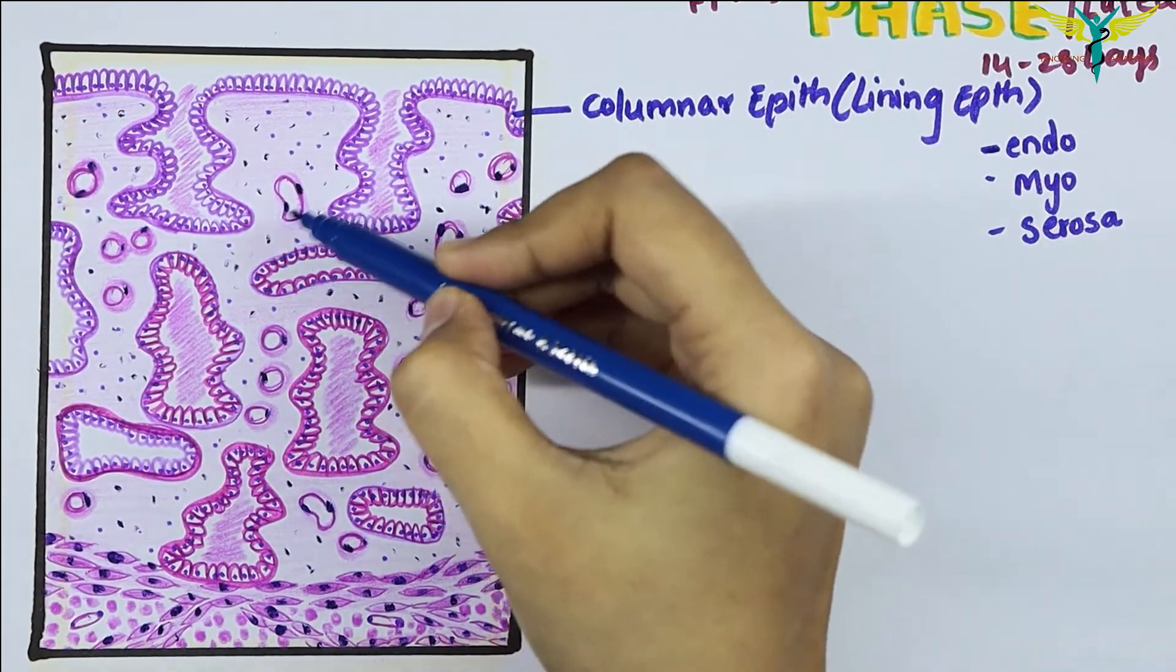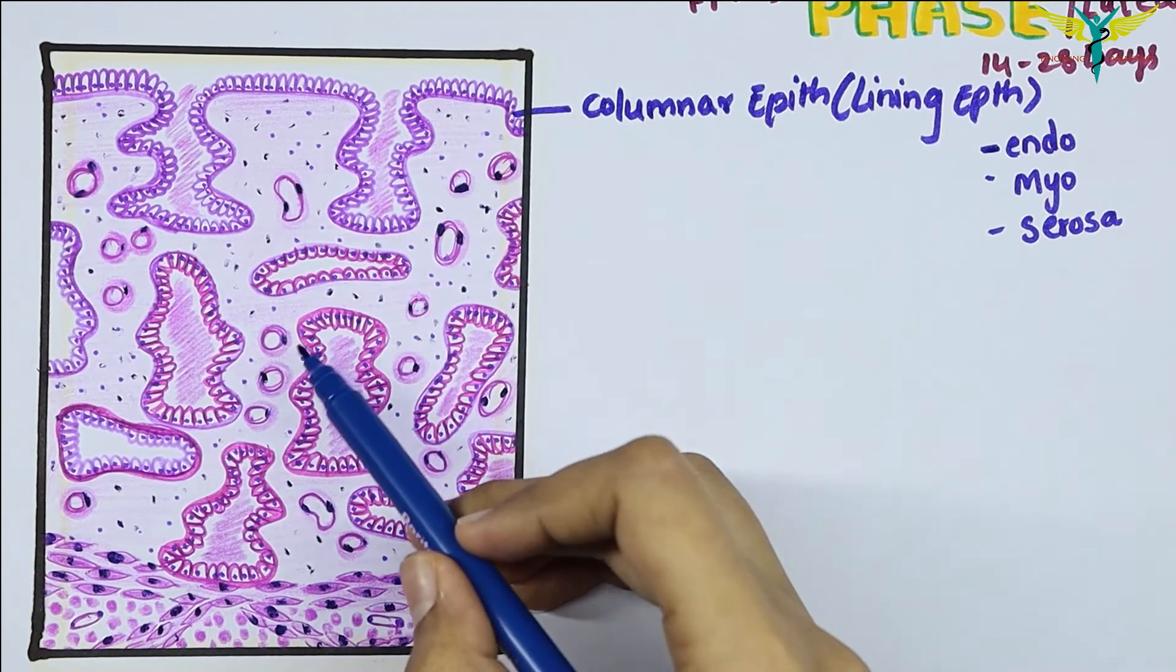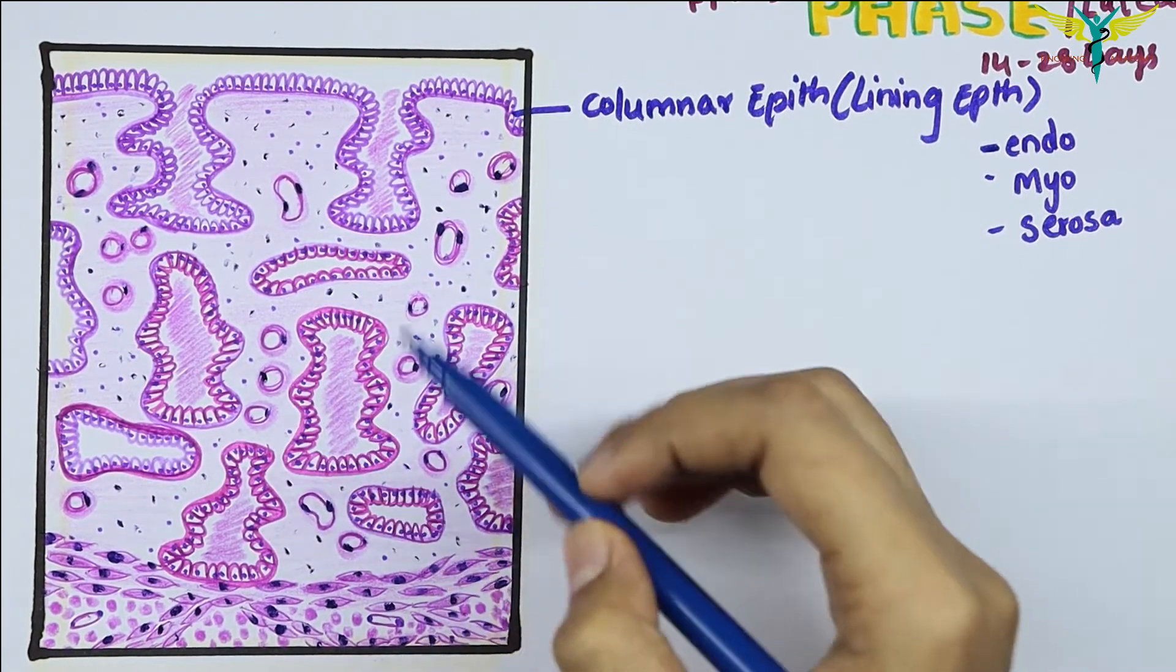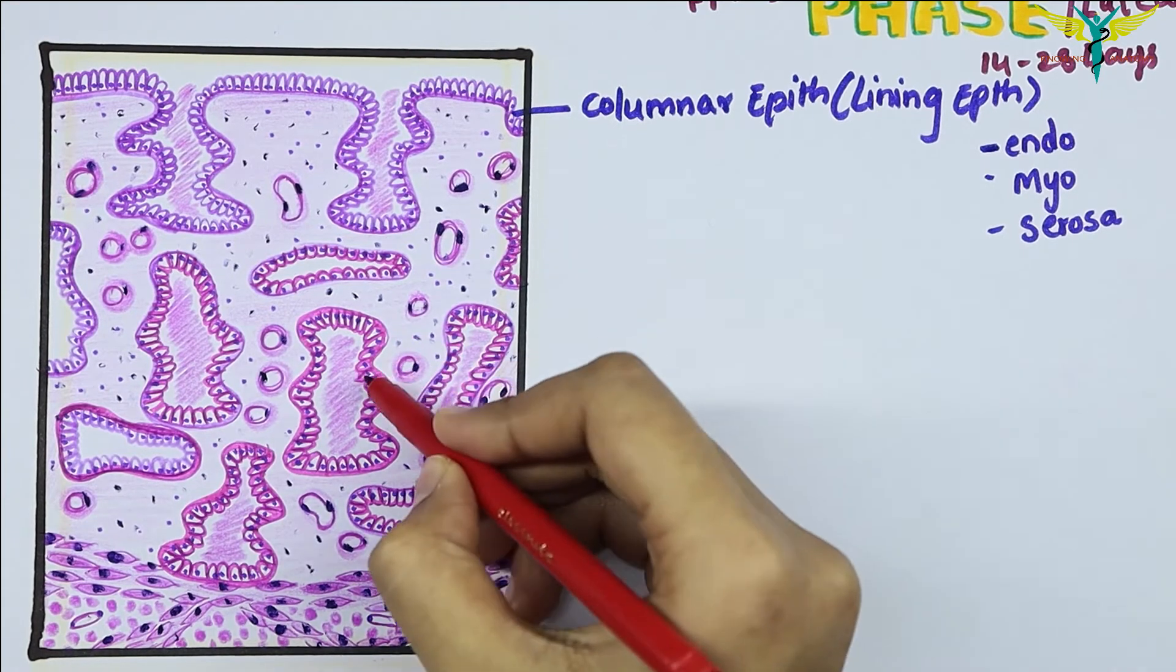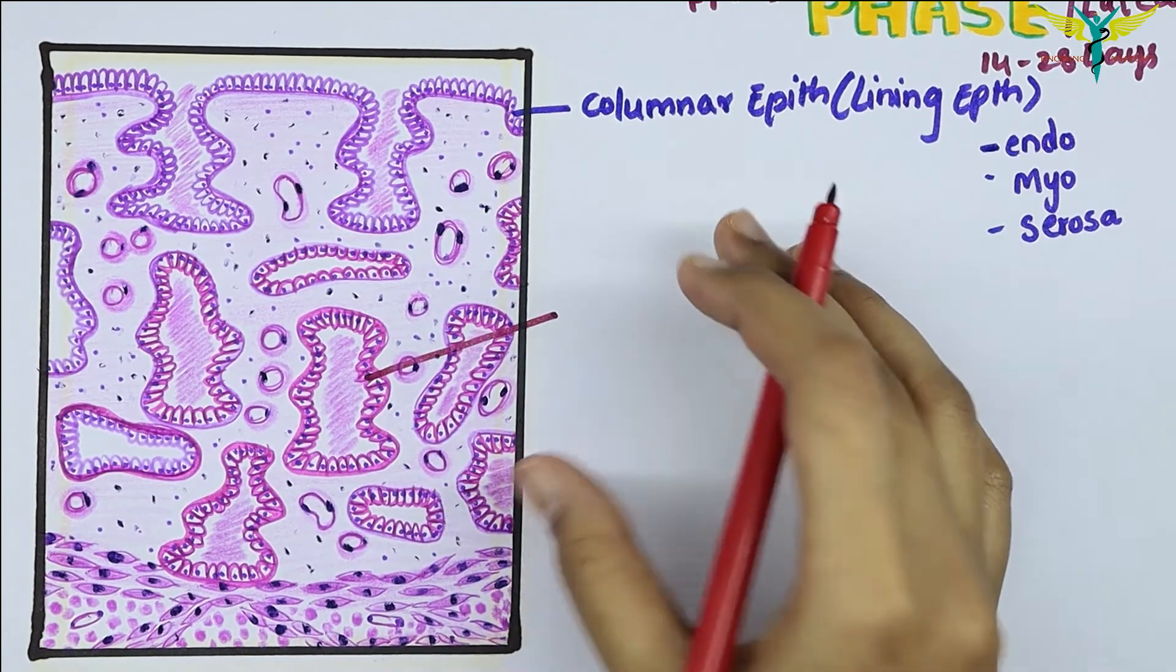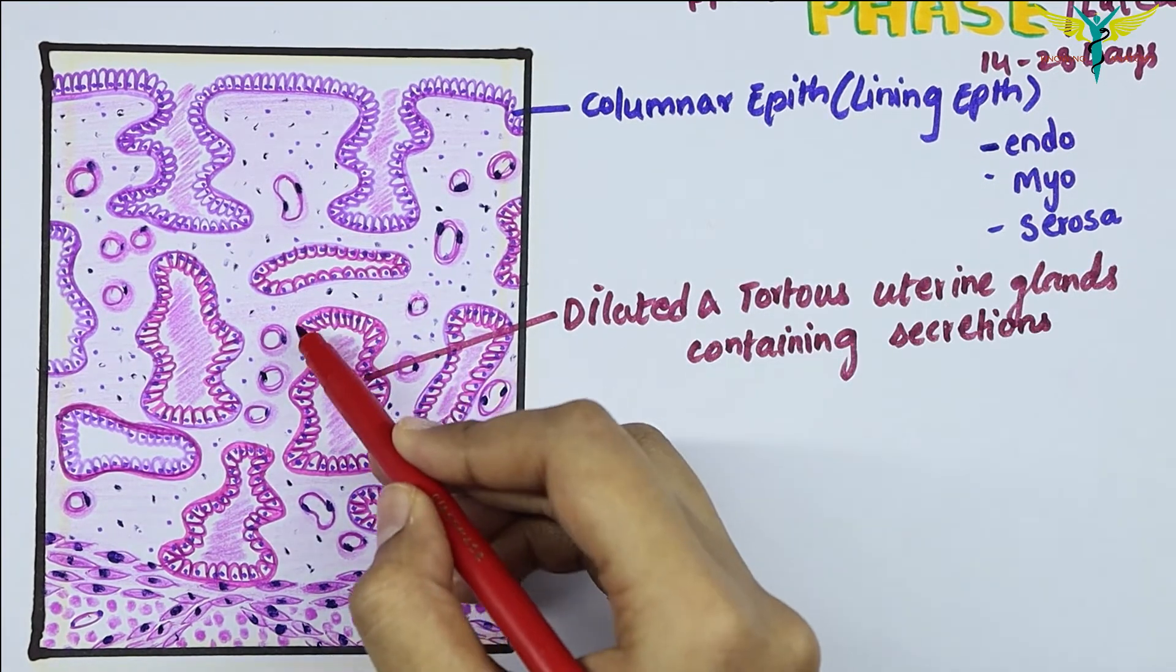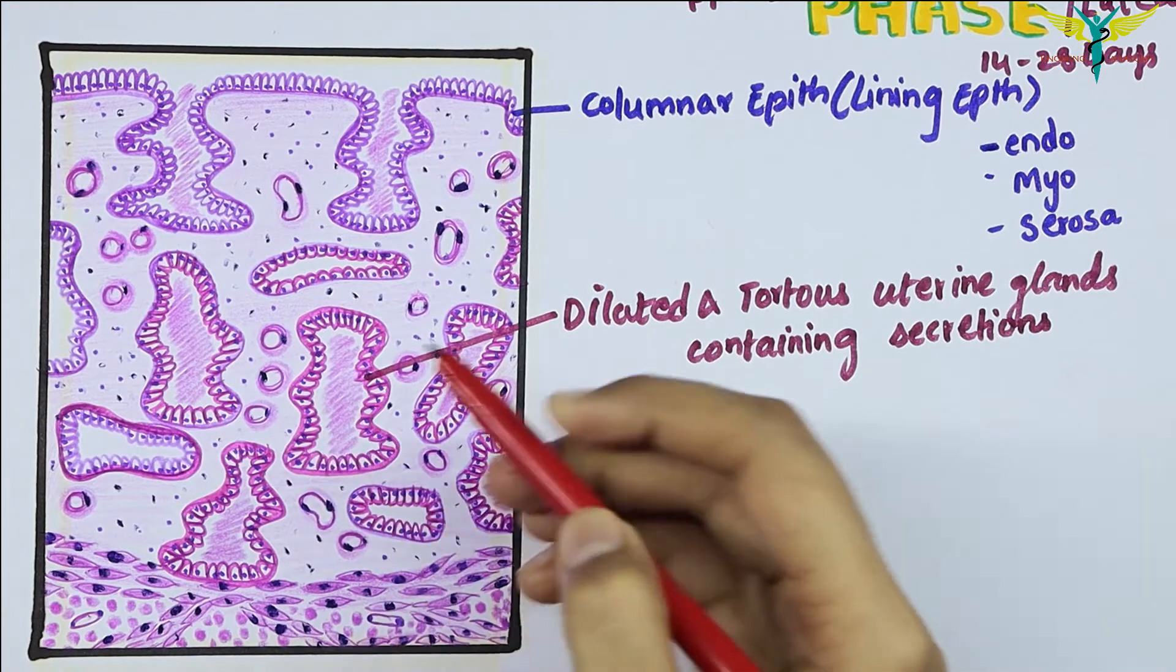The uterine glands are elongated, and they become dilated and tortuous. As a result, they have saw tooth margins in the cross sections. These are the dilated and tortuous uterine glands with secretion, and you can see they have sharp saw tooth-like margins.